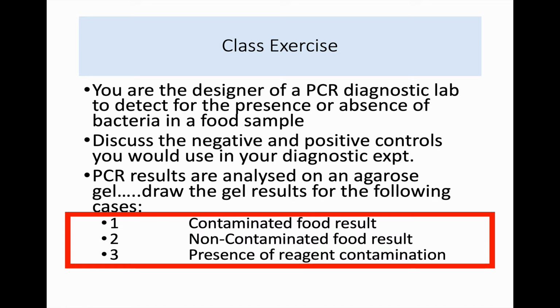So that's something that we have to really consider with PCR, because if we give a false result to somebody in any of these detection methods, that can have a catastrophic event. So we have catastrophic for the individual. And again, integrity, your validation process has to be tested, and the integrity has to be there with all your results.